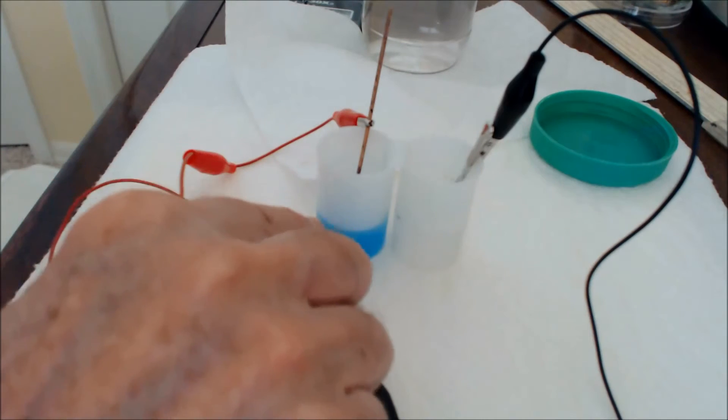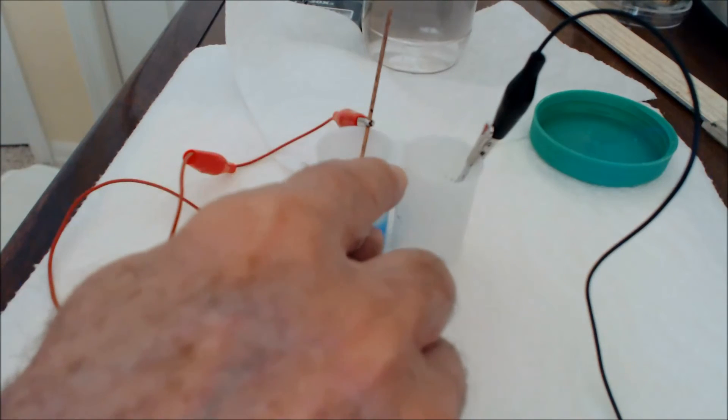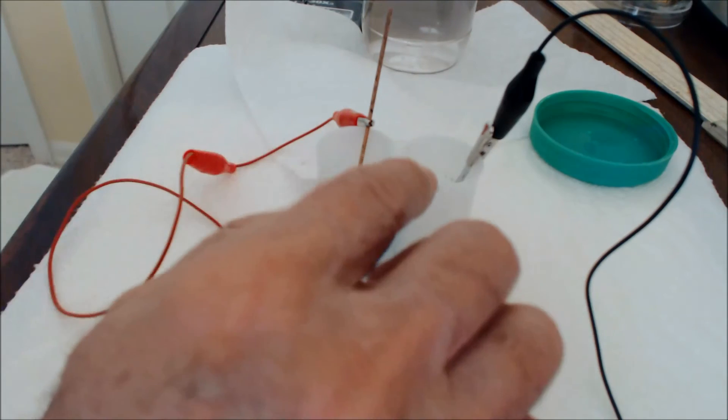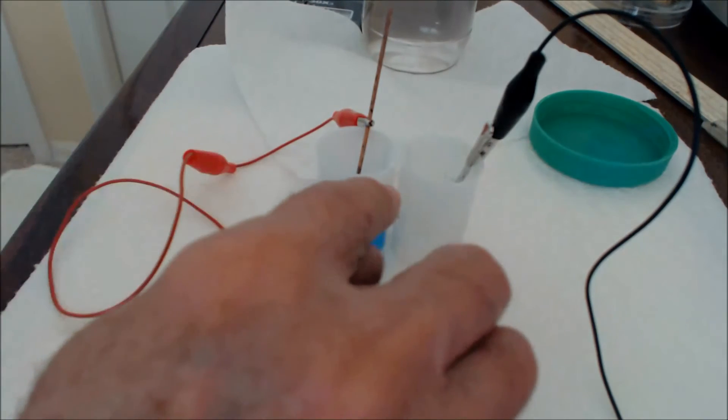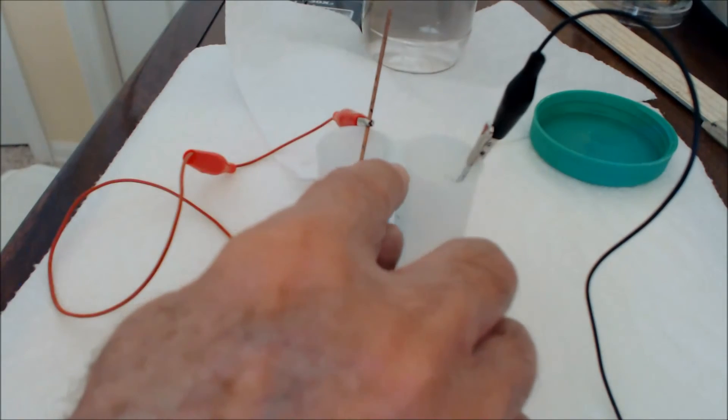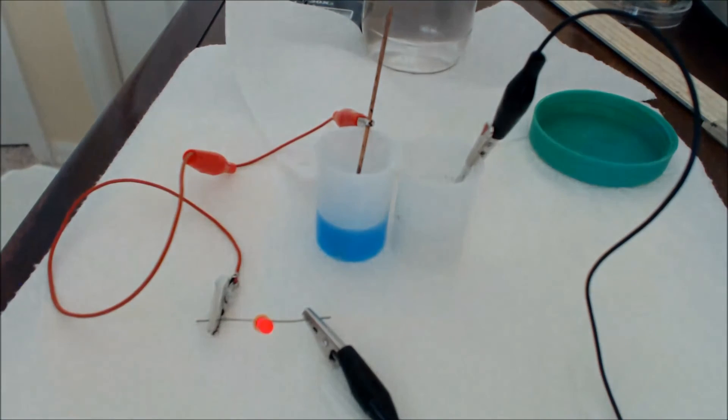Since you are reducing the number of positive ions here, I'm using sodium chloride. The sodium ions go in to replace it to keep this side neutral. And since you're producing positive ions on the other electrode, you're going to get a negative ion, the chloride ion, making that cell, that compartment neutral.